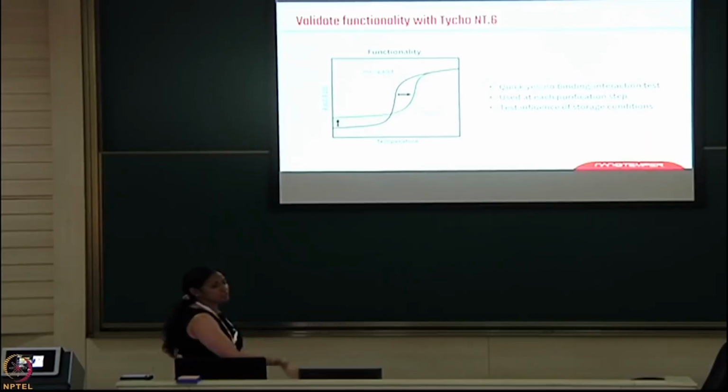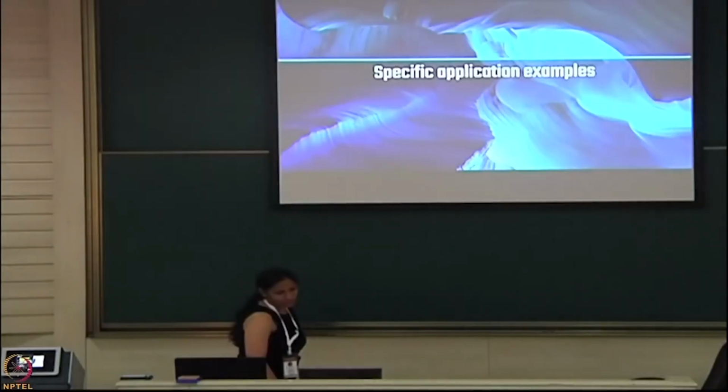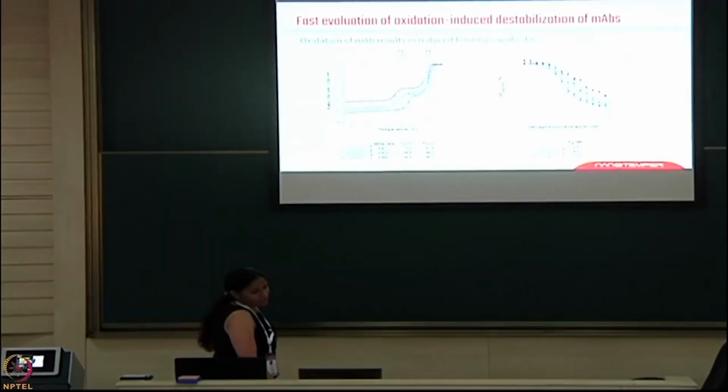With this you can go for further assays, like if you are going for SPR or ITC, you can say that, okay, this protein with this ligand is good because there is the thermal shift, because the Tis are shifting here. Now, I have a few examples which will show you the data.